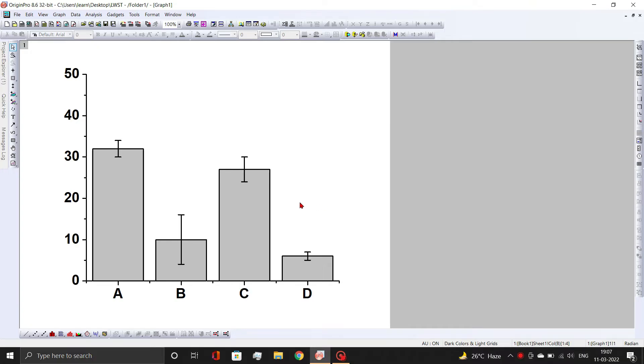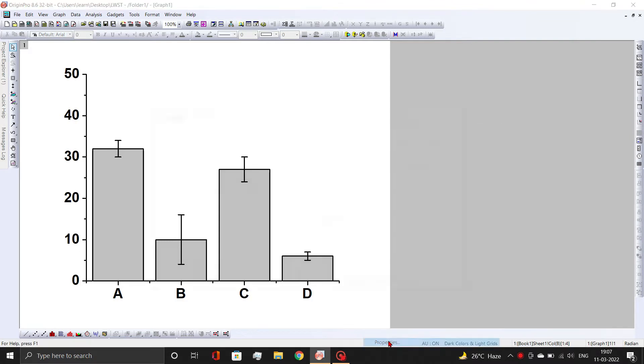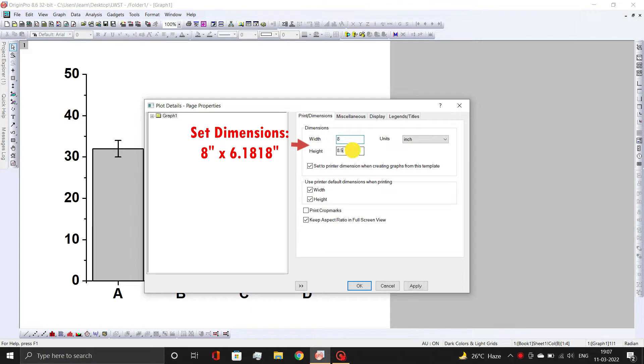Assume this is the bar graph that you want to export as an image. First, right-click on the page and open Properties dialog box. Then change the canvas dimensions from default 11 by 8.5 square inches to 8 by 6.1818 square inches.